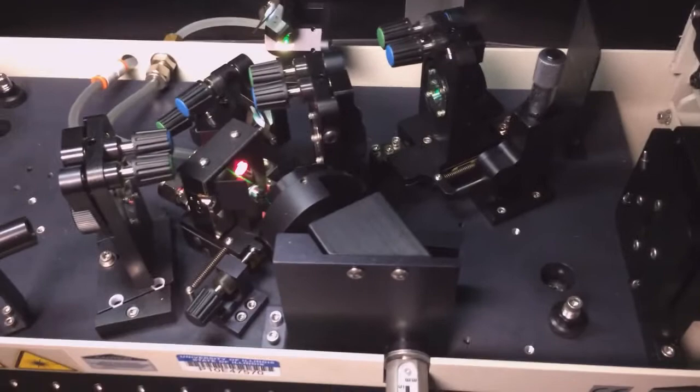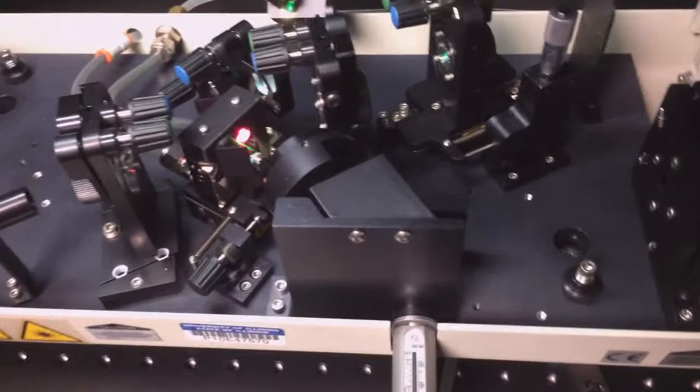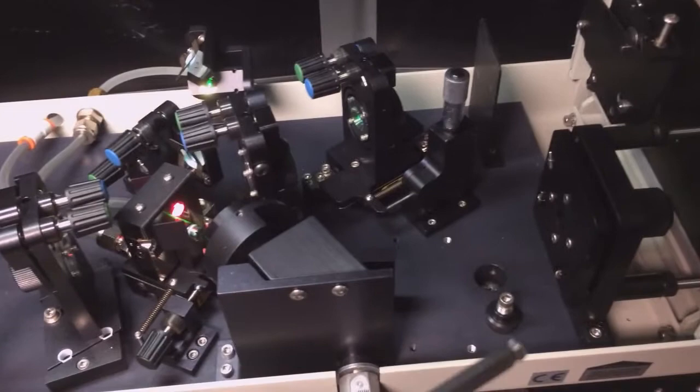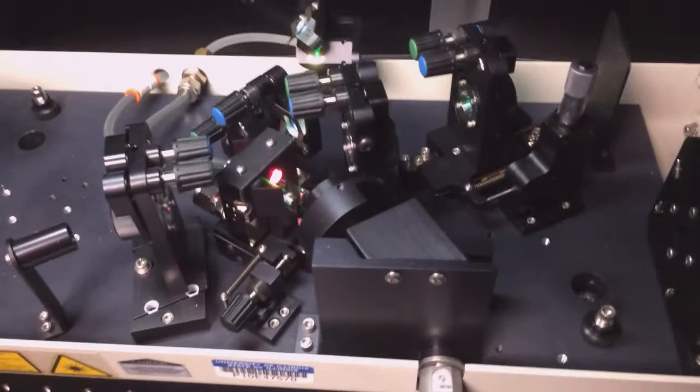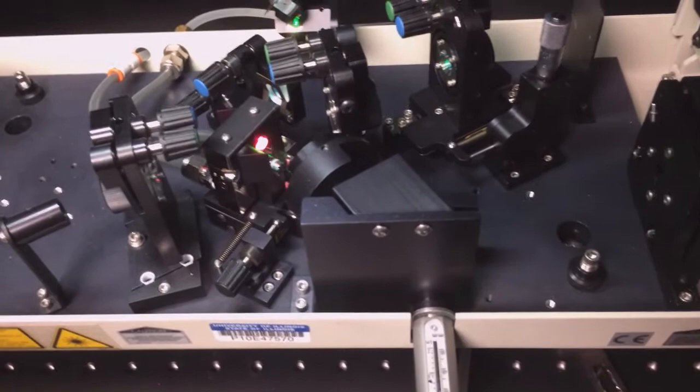So the green light excites the crystal and it fluoresces in all different directions. But the output coupler and the back reflector define the cavity for the laser. But although there is fluorescence in all sorts of directions, the laser works most efficiently when the laser cavity is aligned with the 532 beam.